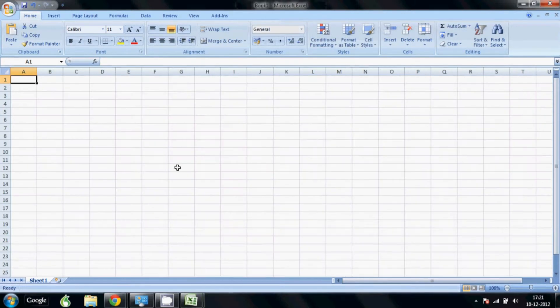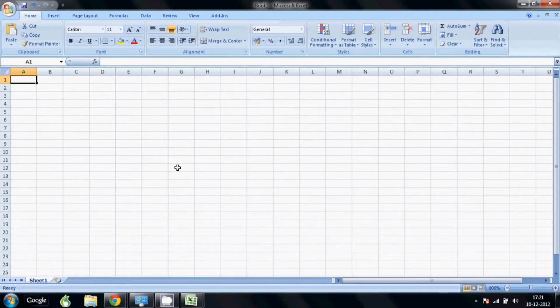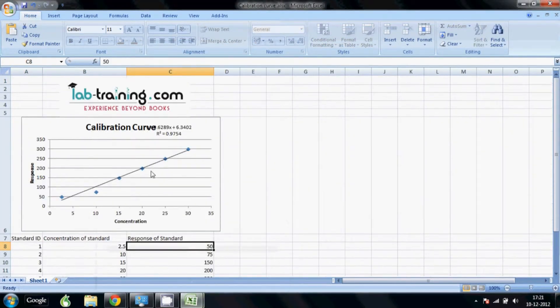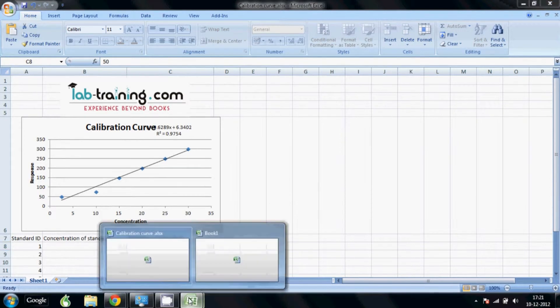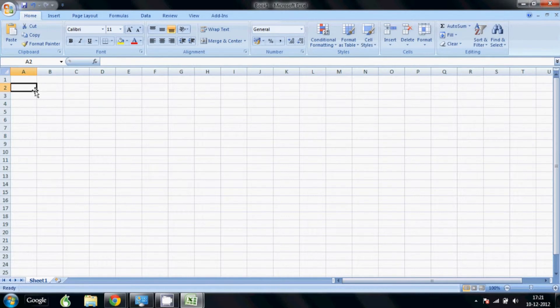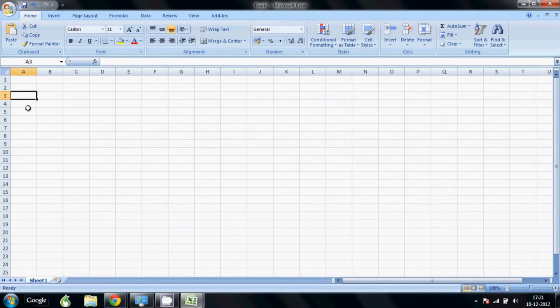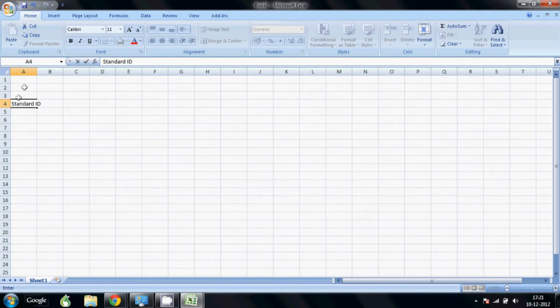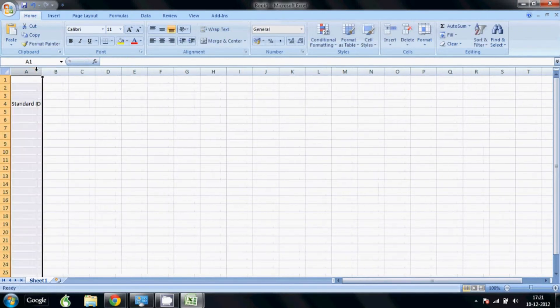First we are going to open a new sheet. In this new sheet, the way we have our logo, you can add your company logo or any other information you want. So this you can see is an unprotected sheet. I can work on any of the cells. So first what we are going to do is create the data fields that we require. First of all is the standard ID, so you can put the identification number for your standard.